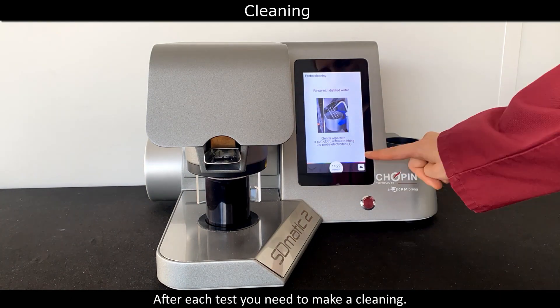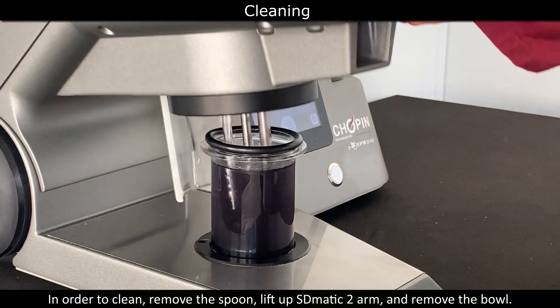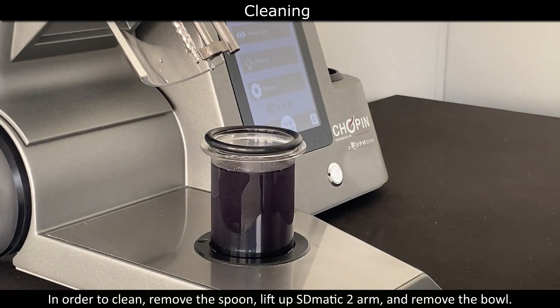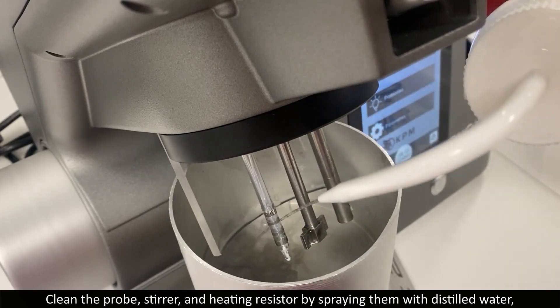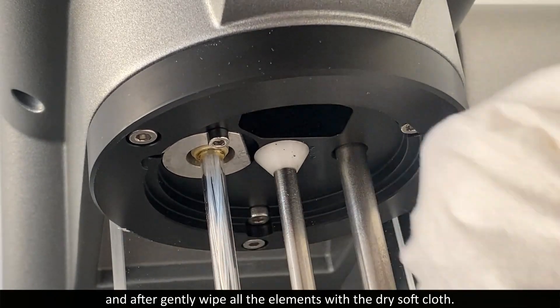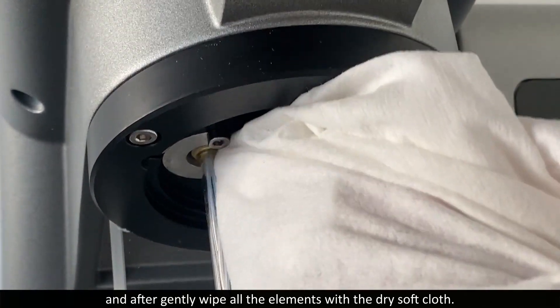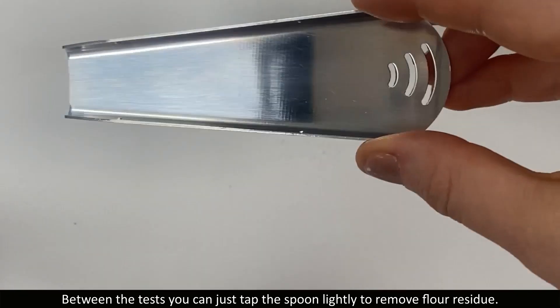After each test, you need to perform a cleaning. To clean, remove the spoon, lift up the S-Domatic 2 arm and remove the bowl. Clean the probe and the heating resistor by spraying them with distilled water, then gently wipe all the elements with a dry soft cloth. Between tests, you can just tap the spoon lightly to remove flour residue.